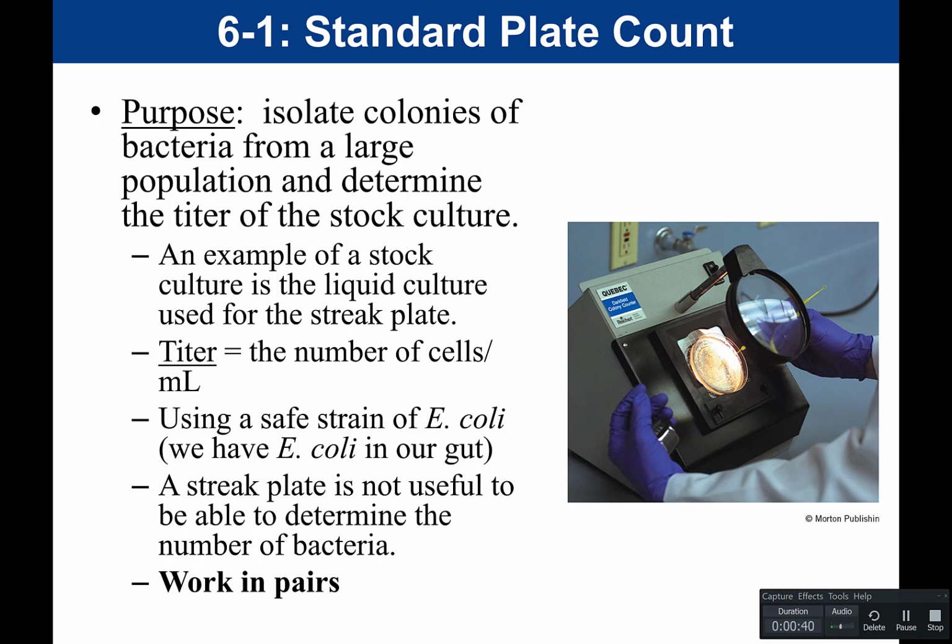Now, when you look at the purpose of the standard plate count, notice the definition or the overall purpose. Isolate colonies of bacteria from a large population. What does that part sound like? What other technique did you look at where we isolated colonies from a large population? And the answer is that is from a streak plate. A streak plate is used to isolate colonies from a large mixed culture. In this case, it's not a mixed culture, it's a pure sample, and we want to isolate individual colonies.